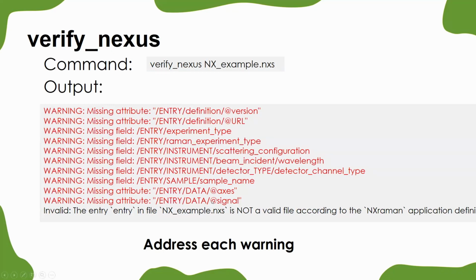It can tell you what things are missing in case you missed something as you went through this manually. It could also be that in the pynxtools reader there is some specific path not found, so that the metadata you provided is not converted by the reader. By this, we can verify what is missing.